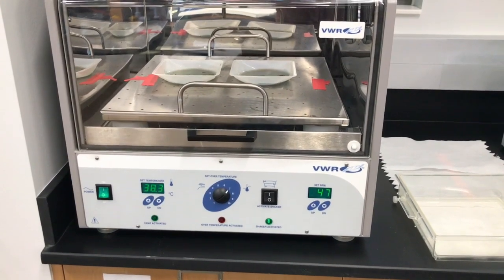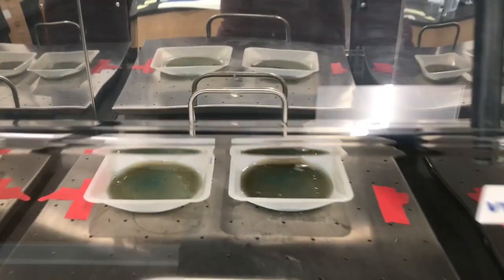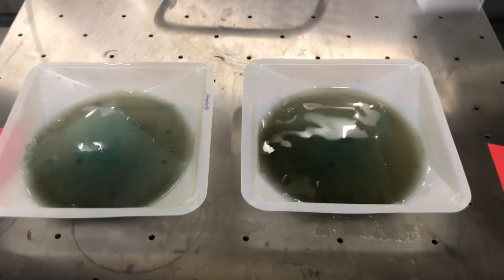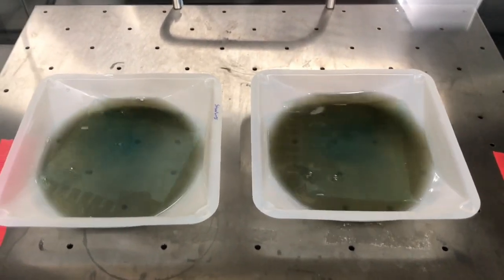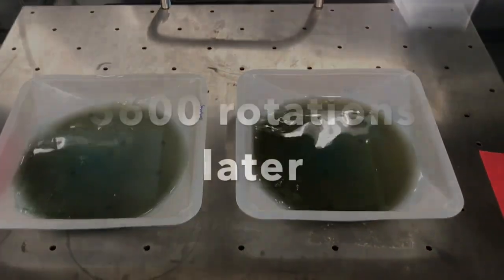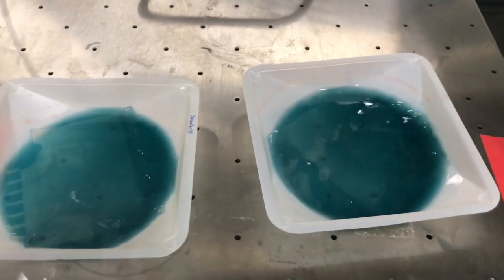What this is going to do is the Coomassie stain is going to interact with the proteins like they do with the protein quantification lab and bind to them, and it's going to give us a blue color that we're actually going to be able to see them on the gel.